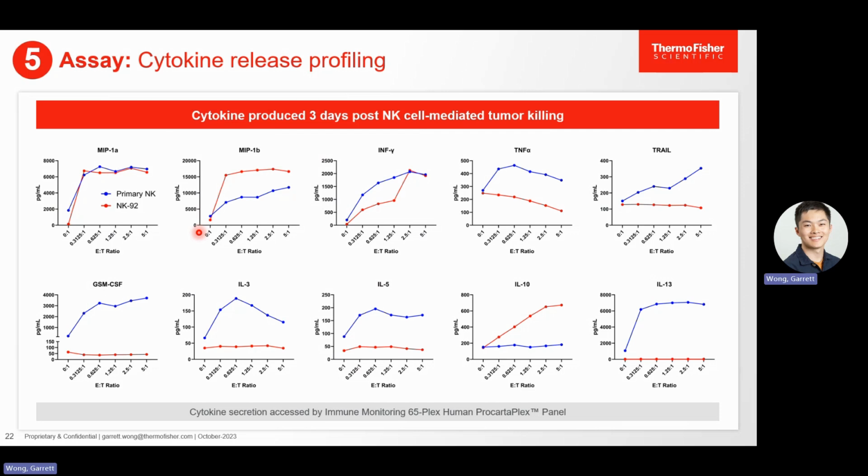In future experiment runs, the team will be testing different harvesting time points to make sure that these saturated signals do not occur in future runs.